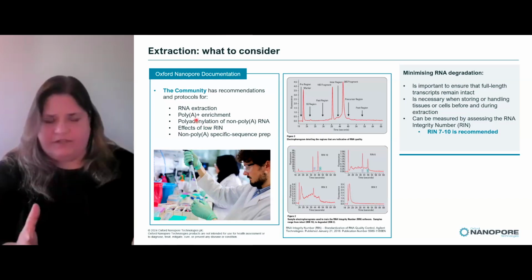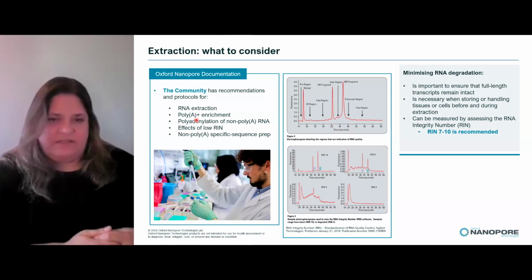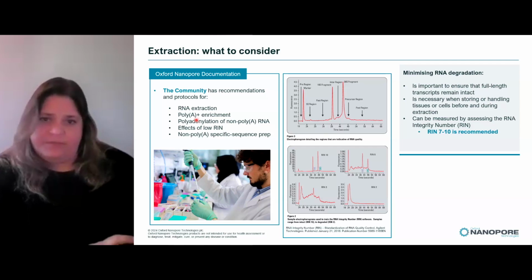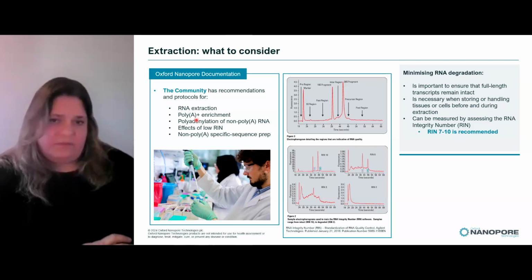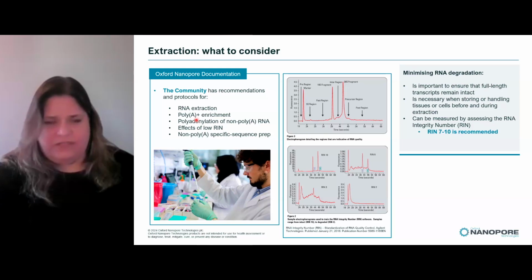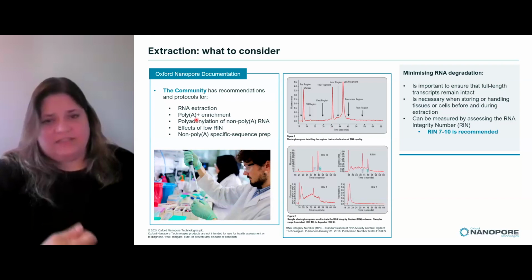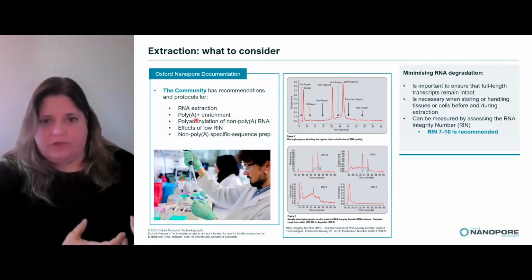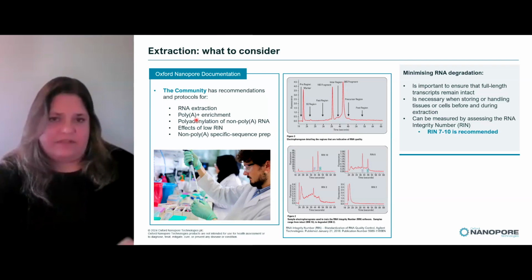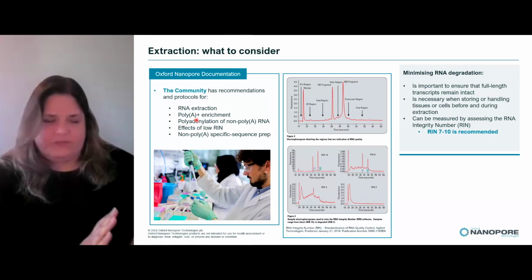When you extract RNA, you get total RNA from a cell, but 95% of that is ribosomal RNA or tRNAs. Some people are very interested in those. Most people want to look at protein encoding RNAs, or mRNAs, messenger RNAs. And sometimes you are better off enriching for those, because that's only 1 to 5% of your actual total RNA extraction. So sometimes it's nice to just yank those out and look specifically at those and not worry about the 95% of other stuff, which to you would be junk, to others not so much.